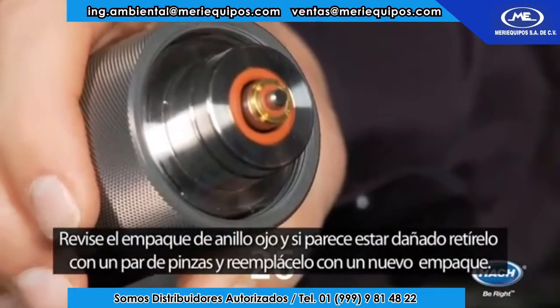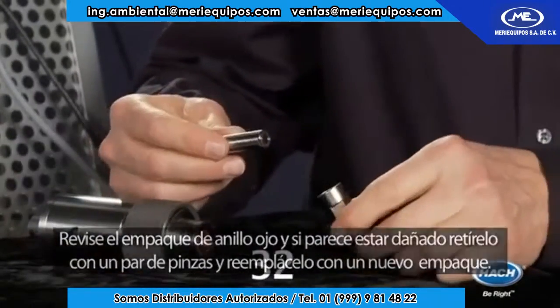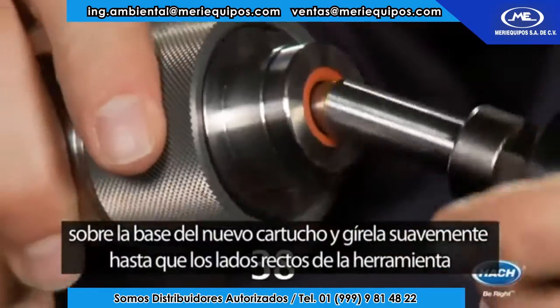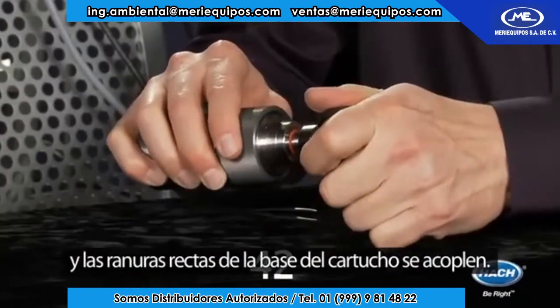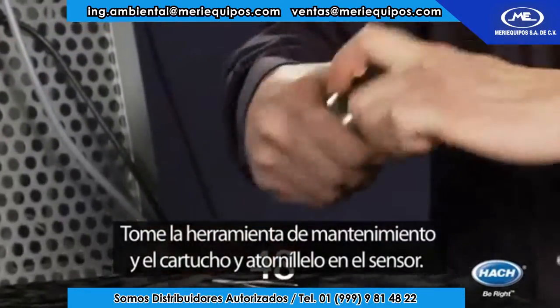Check the red o-ring, and if it appears damaged, remove it with a pair of tweezers and replace it with a new o-ring. To replace the spot, push the maintenance tool as far down as possible over the new sensor spot and turn gently until the square side of the tool and the square slot of the sensor spot engage. Then take the maintenance tool and sensor spot and screw into the sensor.